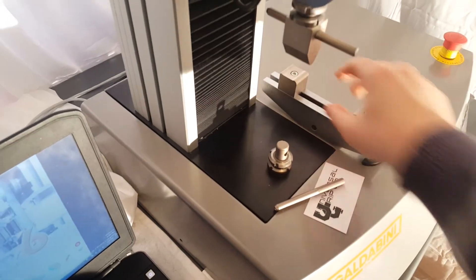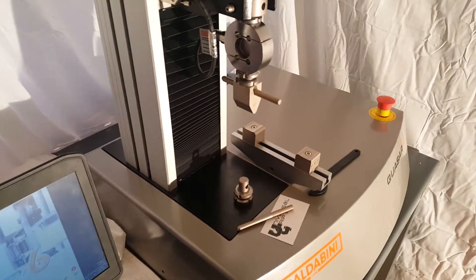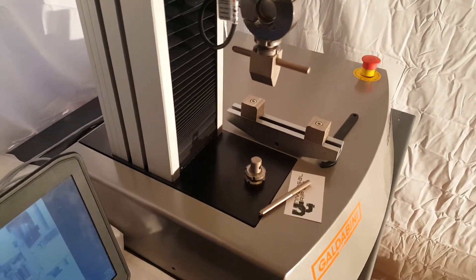This machine can run flex tests like I have it set up for, but it can also run tensile, compression, shear, and peel tests — really any number of ASTM standards.